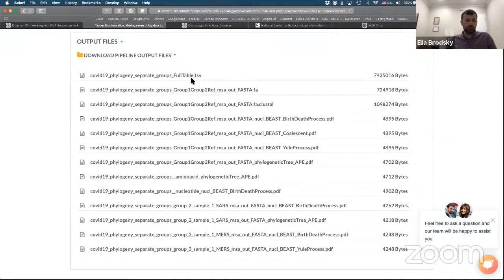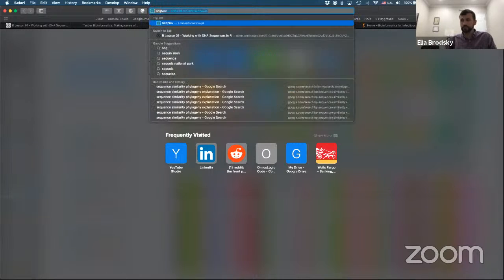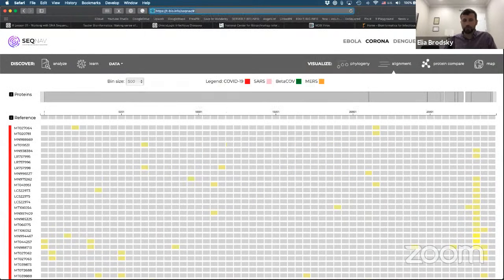Importantly, we can visually interrogate such data. This specific output right here, you can open in Excel, but it's a fairly large data file, and we'll talk about how to deal with these data files. But I want to briefly illustrate visually what information this data contains. So please go with me to this link. This is the direct output from what we just saw.